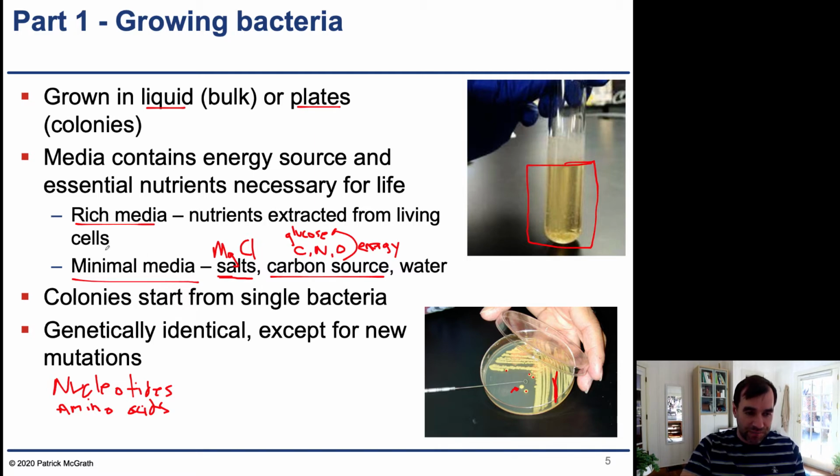new bacteria. So that's what you do if you want to make it hard for the bacteria. That's kind of like the most challenging media, where it has to synthesize all of those different things. And so now this kind of motivates the definition of rich media. Rich media is media where the bacteria does not have to synthesize these things from glucose.